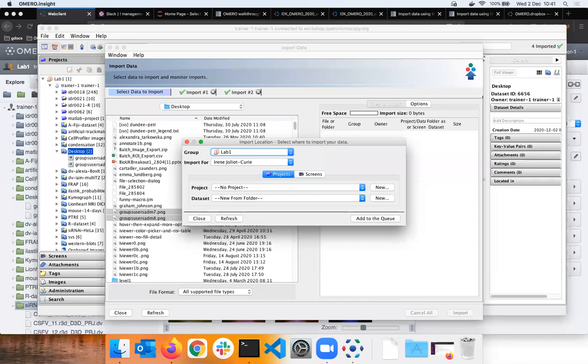You can automatically say each folder becomes a tag, create a tag, and add that to the image itself. Then in the tag search, people tag, I don't know, Monday, September, 2020, and you will find all the images that have those tags. So that could be a way of creating an artificial hierarchy.